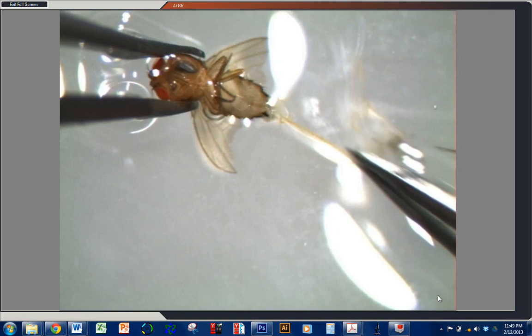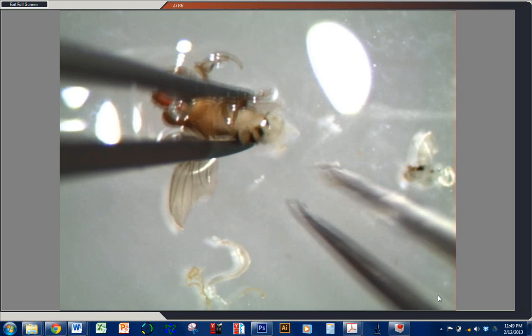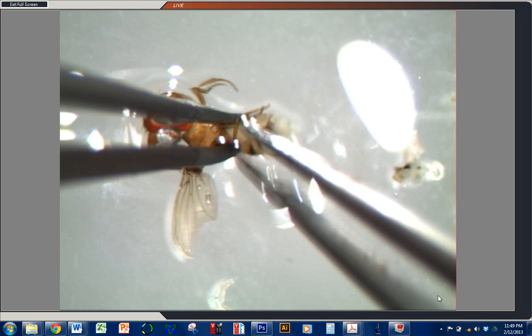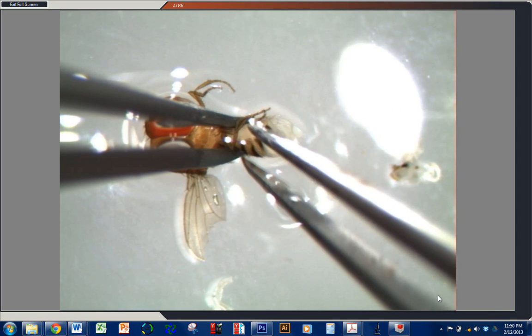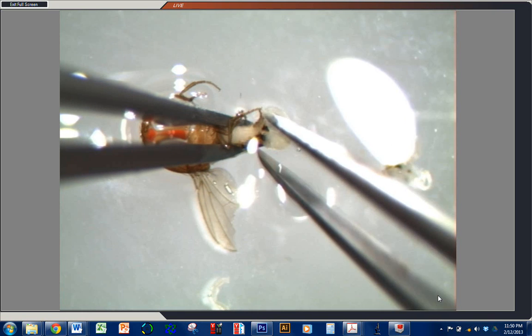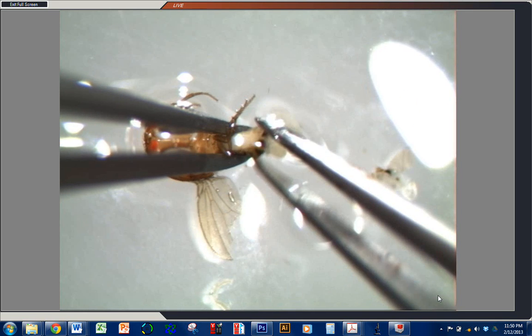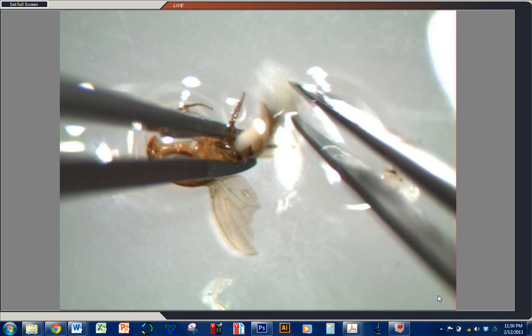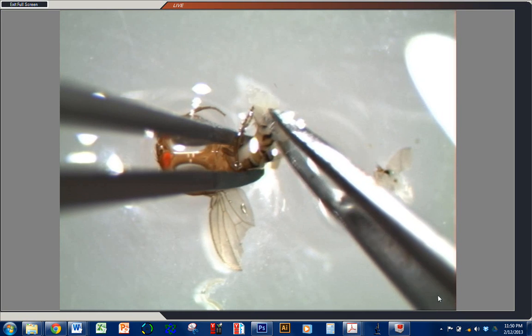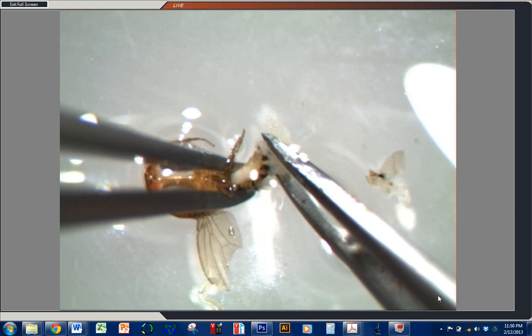Out come the intestines and trachea, and Malpighian tubes. Then if you give the abdomen a little bit of a squeeze — you're not crushing the tweezers completely together, what I'm doing is squeezing more like you would toothpaste out of a tube — you can see the ovaries have started to emerge right here. You're going to grab them, without squeezing too tight; you don't want to completely rupture them.